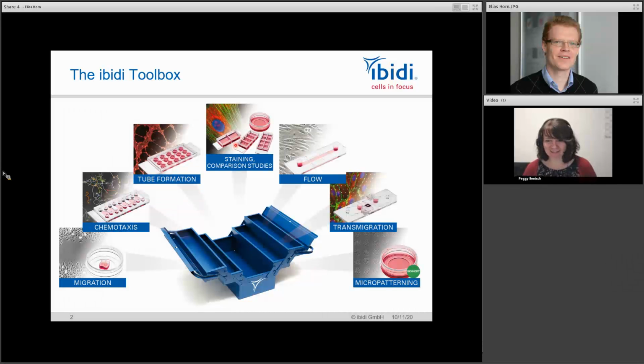In the meantime, we can go to Nastaran. They're asking if we tried to transfect organoids using a transfection reagent, and what would be the most efficient one. No, we have not tried that. Sorry.